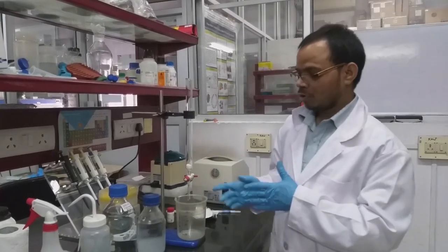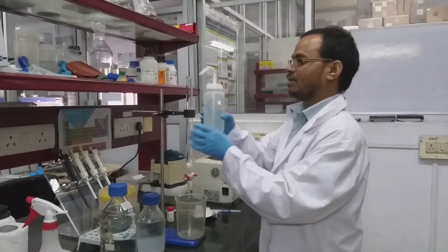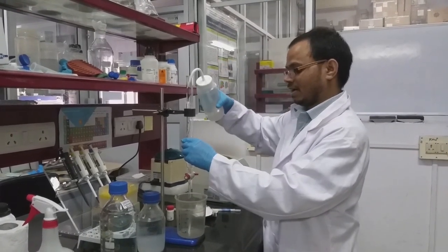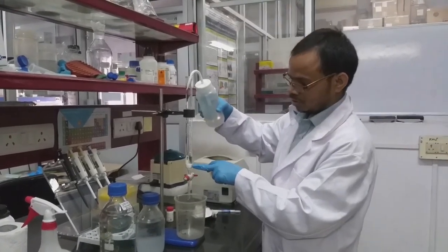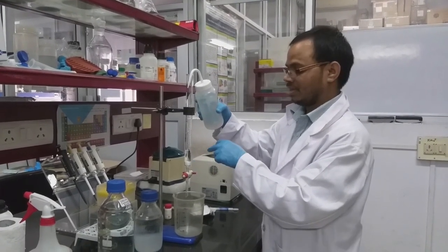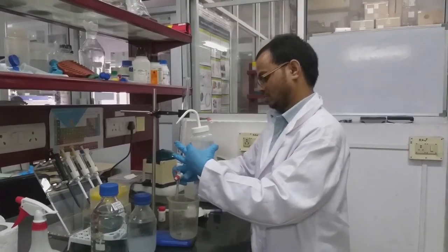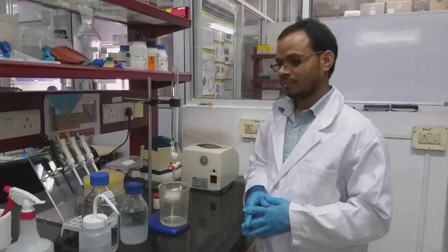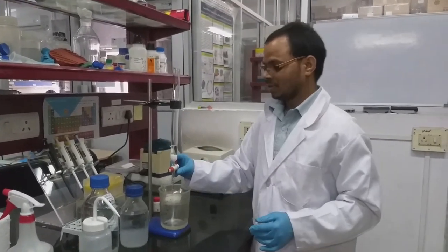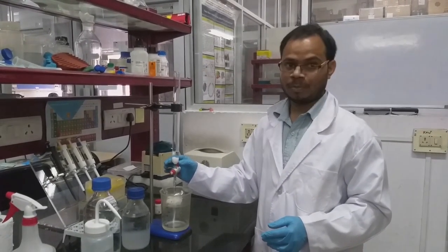So before loading the beads, I am going to wash the column properly so that there are no other particles present inside the column, and also to soak the cotton which we inserted in this. Now we washed the column properly, so the bottom cotton also soaked properly.